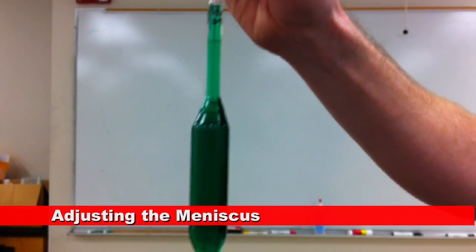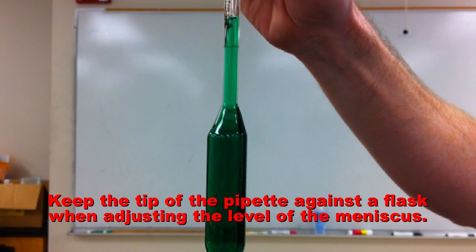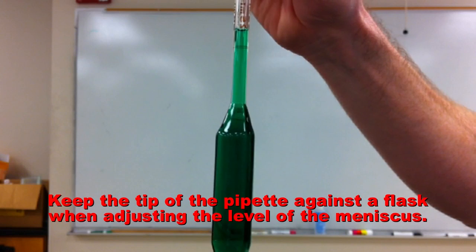Raise the pipette such that the line is at about eye level. Touch the tip of the pipette to a beaker or a flask so that you can carefully control the lowering of the solution.